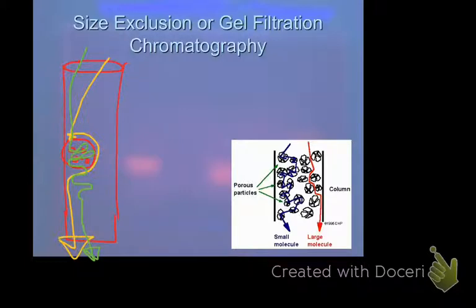And they do what they call a purification profile or elution profile, but you're just trying to make as pure a sample as possible in your protein. And at each step, you're going to lose a little bit. Because each time you try to purify it, it's not 100%.